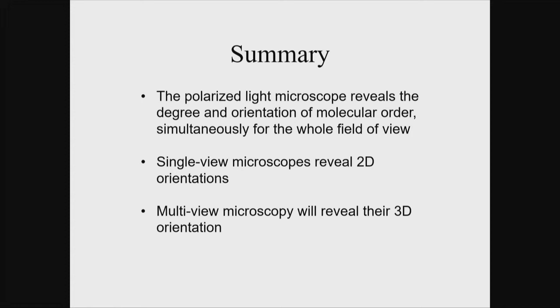Whereas if you have two imaging systems that look along perpendicular axes to each other, you have isotropic resolution. One view gives you the high resolution in the direction the other view lacks. So there are different ways of implementing multi-view imaging, and we are using both types.